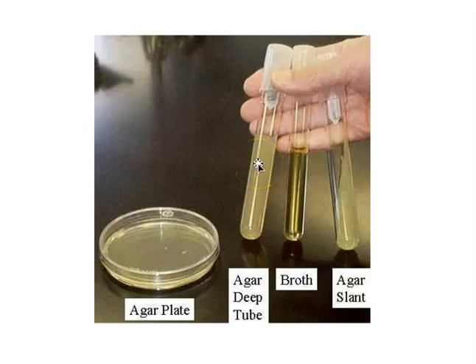So if we're trying to culture bacteria that have a bad relationship with oxygen, either they don't use oxygen or they find oxygen toxic, they can actually grow in the deeper reaches of the agar where they're going to be protected from oxygen exposure.